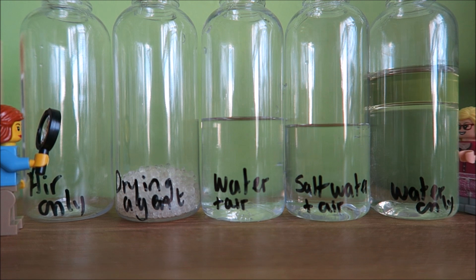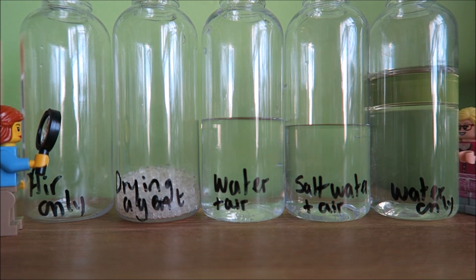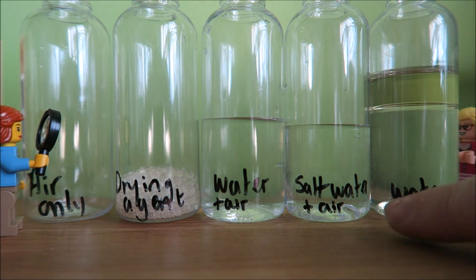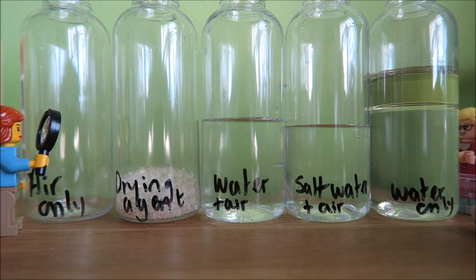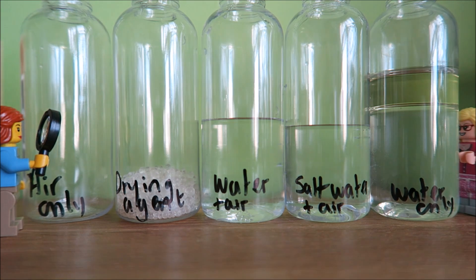We have a drying agent in here, which is going to remove any moisture from the air. This is just water in here, so this will be water and air. Here I have salt water and air - I've just taken some water and added some normal salt to it. And this is water only - boiled, cooled water with a layer of oil on top to stop any air getting in.